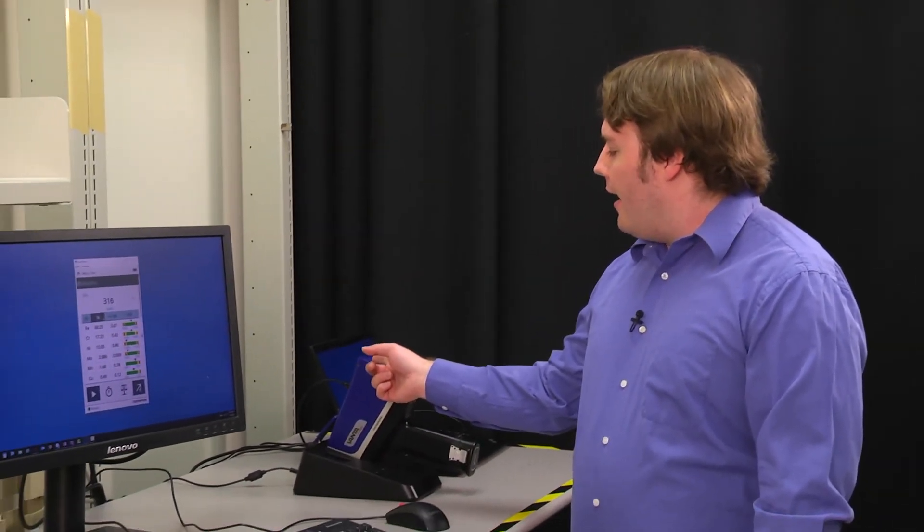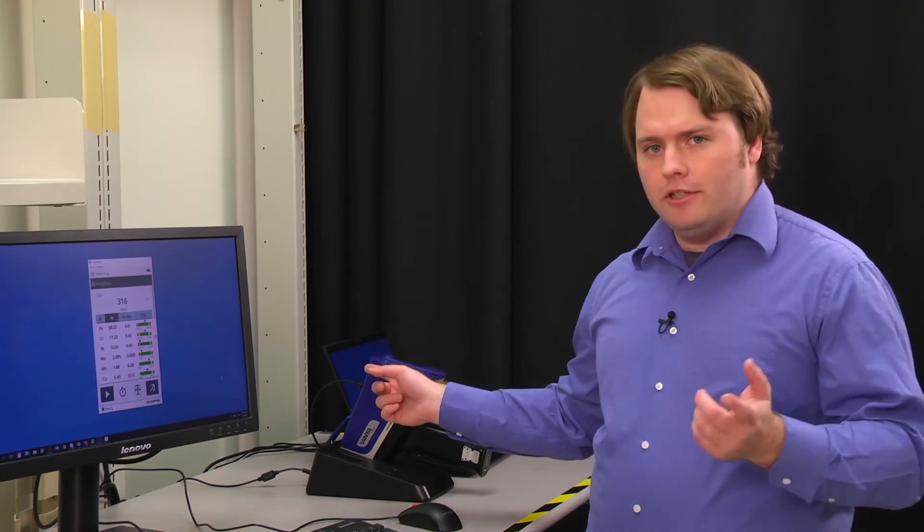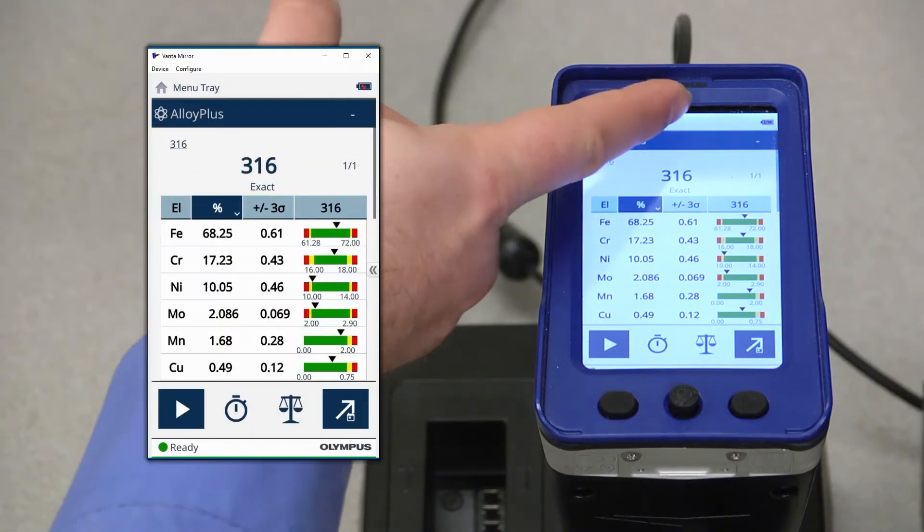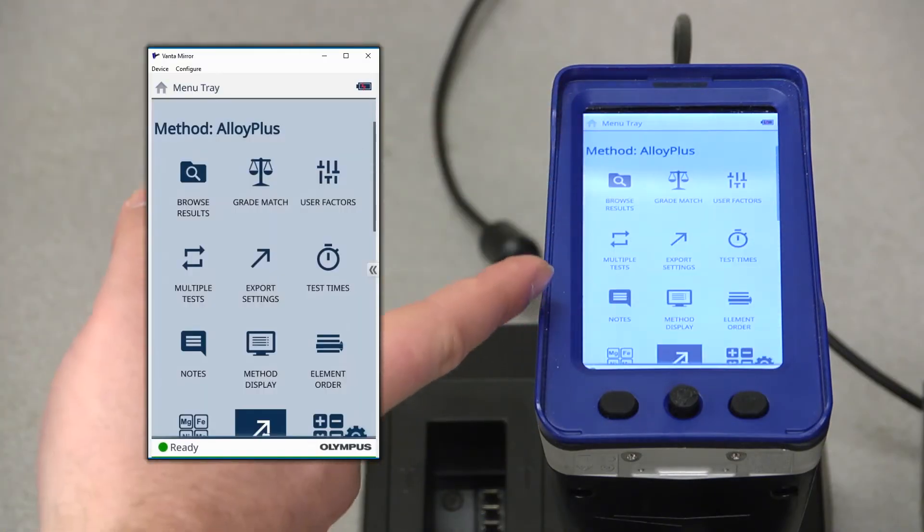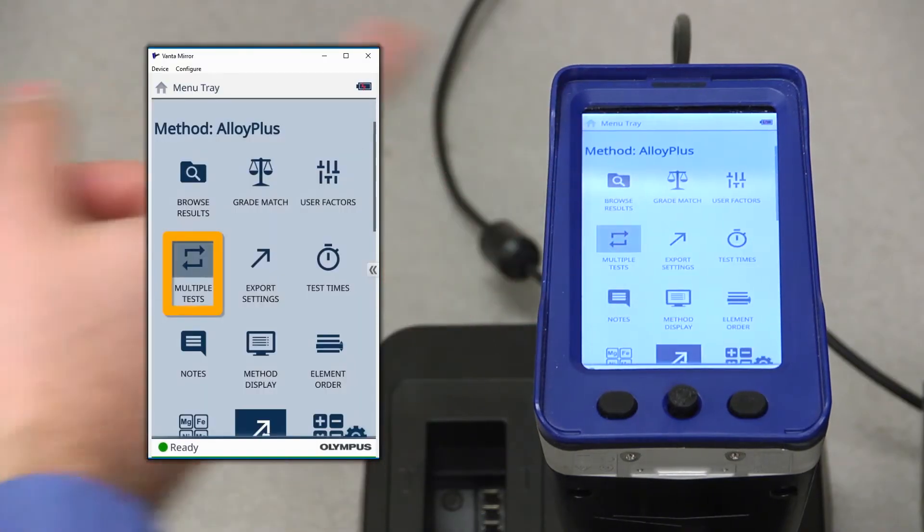For now, let's take a look at live averaging. To access the averaging features, log in and have the method selected that you wish to do testing in, bring down the drop down menu, and select the option for multiple tests.